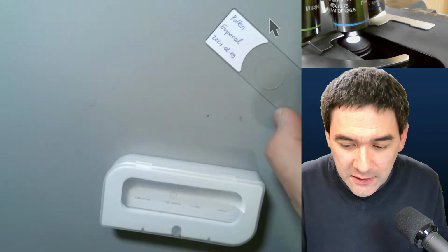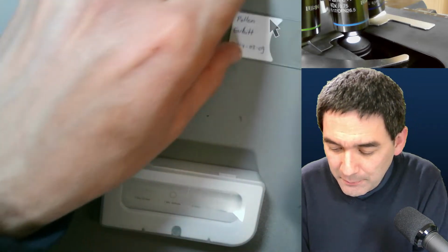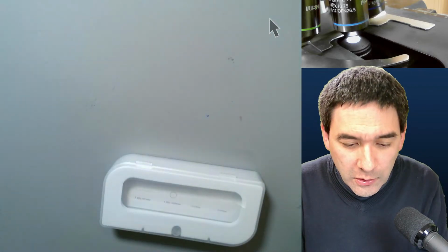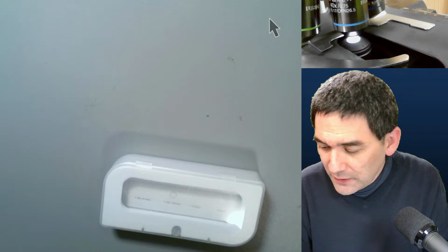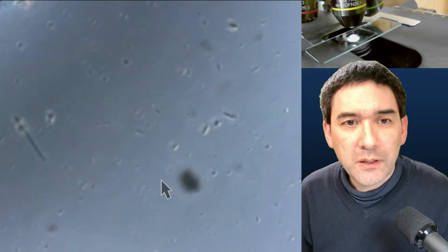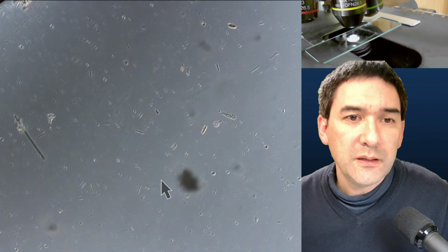And I would now like to look at some water samples using oblique, dark field, and so on. Because sometimes people want to see a few living things as well. So let's have a look at this here. Again, I was hoping to observe some paramecia, but unfortunately they didn't grow or they were eaten up.